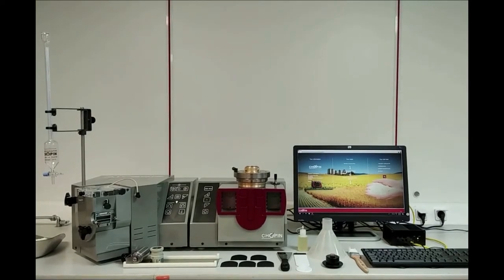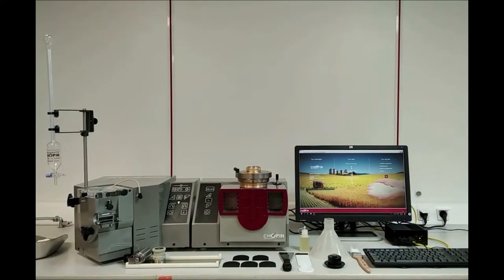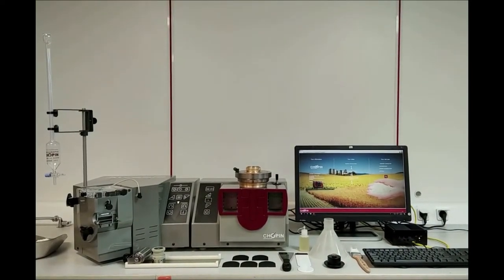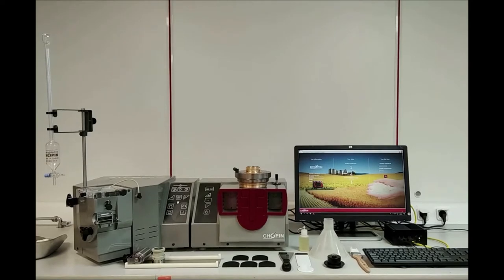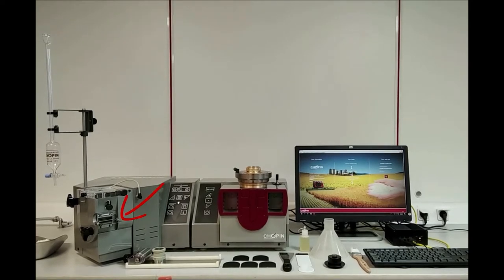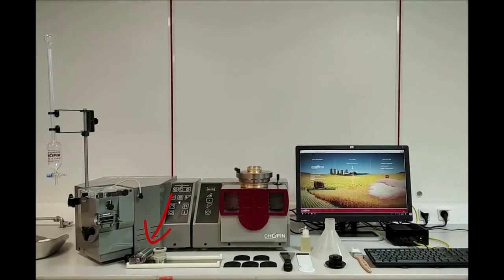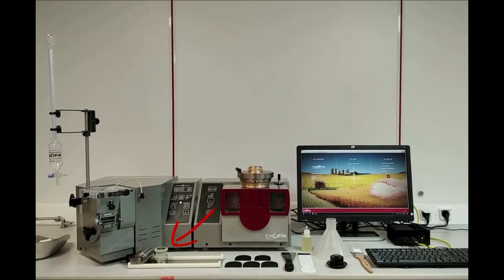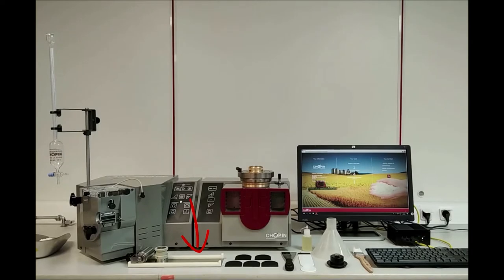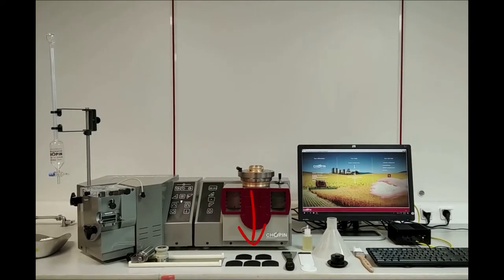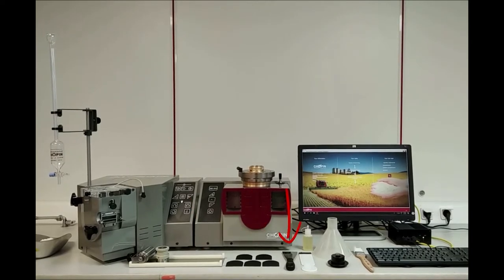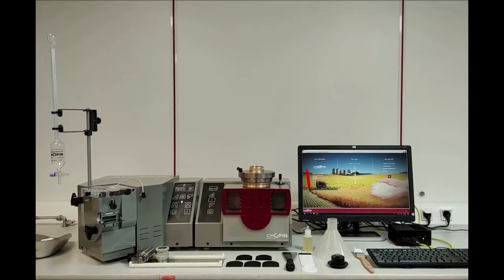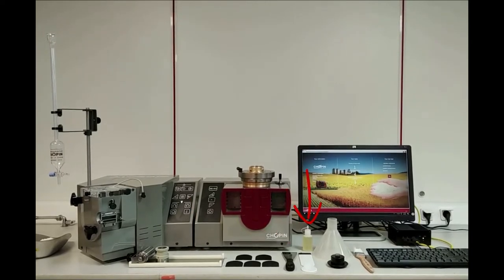Additionally the Alveo PC comes with all the accessories necessary to manage the dough: the extrusion plate, the steel roller, the cutter, the laminating plate, the resting plates, a knife and a spatula, and a dropper for the oil.